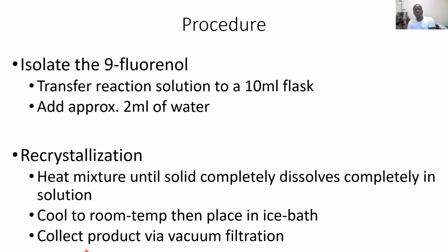So how this is done is, your pure compound that you're expecting is soluble in the chosen solvent when it's hot. And then as it cools back down, it crashes out, it crystallizes out of the solution as a pure compound.